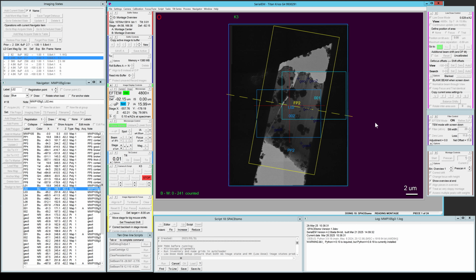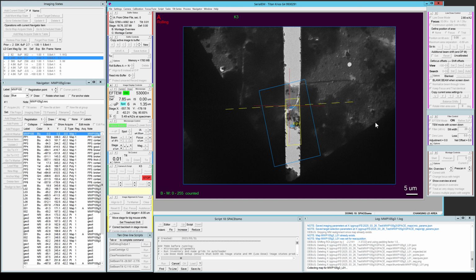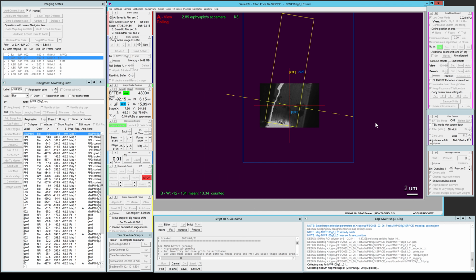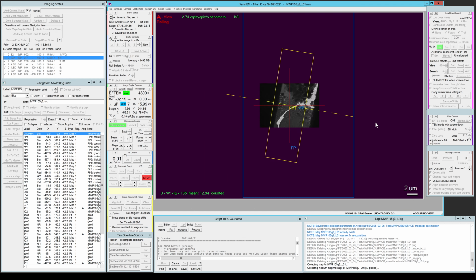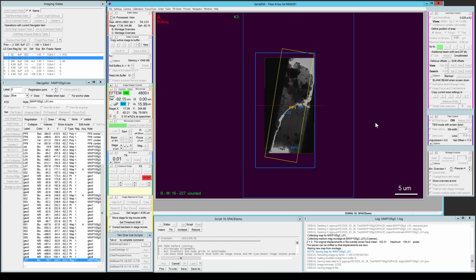Then it will already find the whole grid montage, quickly load it, load an intermediate mag image just to get all the pixel sizes. And then it will find which maps have been marked for reacquisition and only acquire these specific maps. Now we of course didn't go ahead and try to clear some of the accumulation, but you can see that the map is much tighter since we reduced the padding.